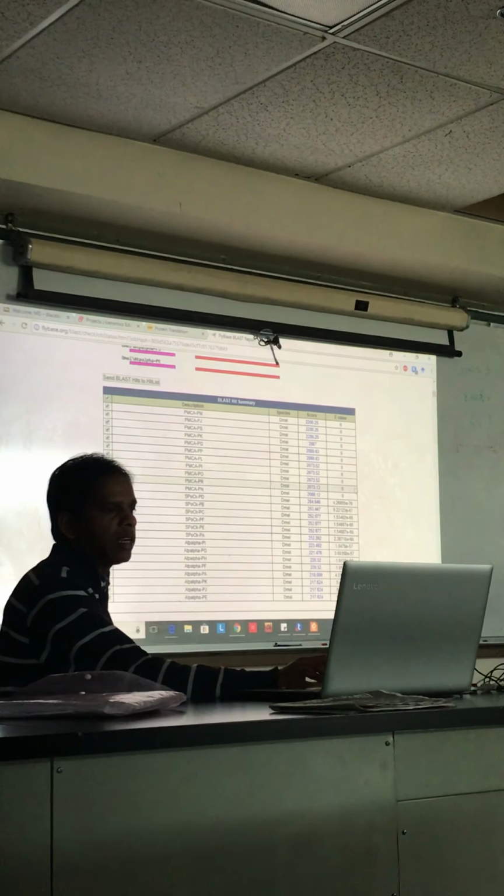So, real quick, with the screenshots, do you want us to get the top 20 and the color diagram? Yeah. Okay. Take the color diagram and then take a screenshot of this table. Just take the first, because we're not going to consider this. But you have to take this table and analyze what you mean from this table. Yeah, I got the table.